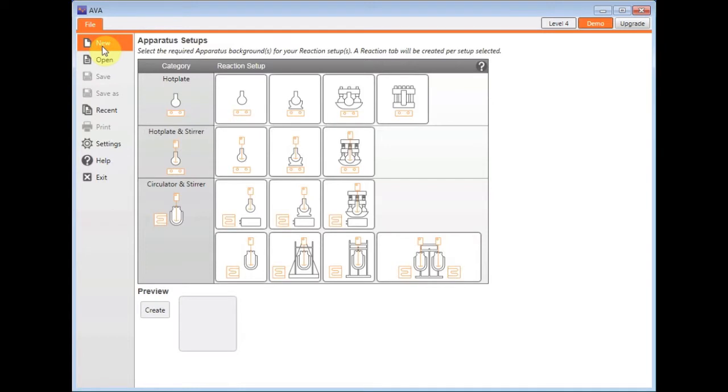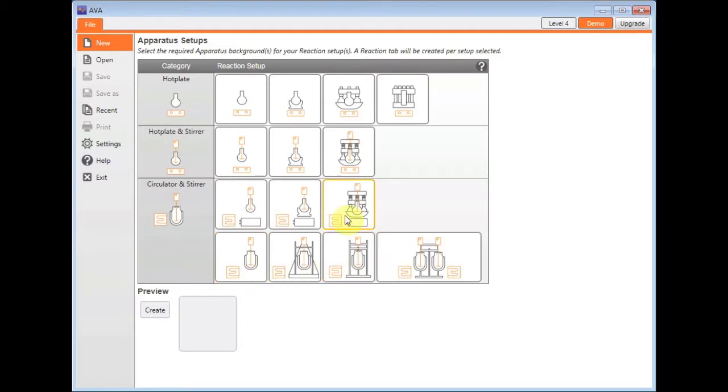This window shows you all the backgrounds that you can use for your apparatus, including everything from a standard flask to a reaction vessel to the Radleys products such as Lara, Tornado or a carousel.